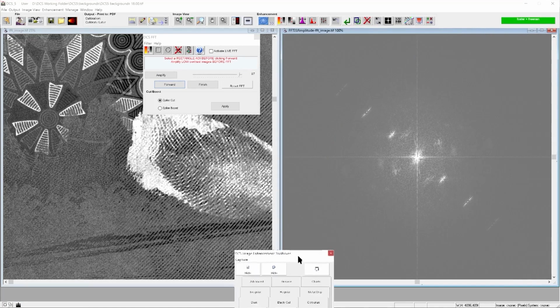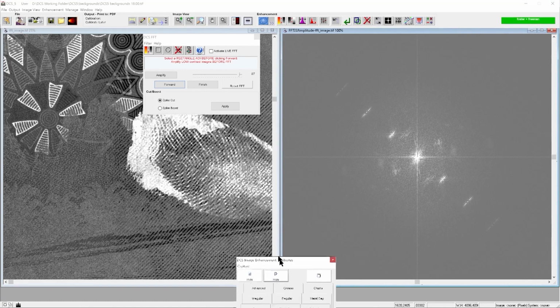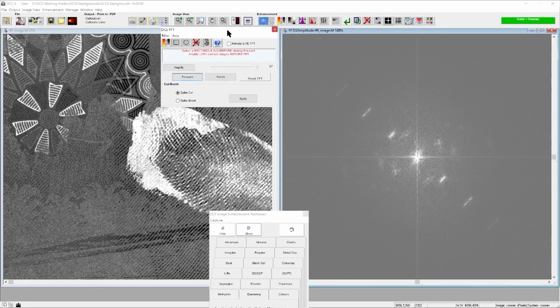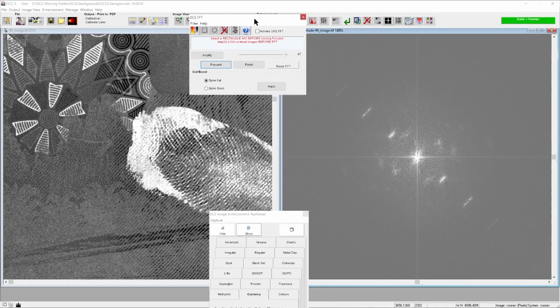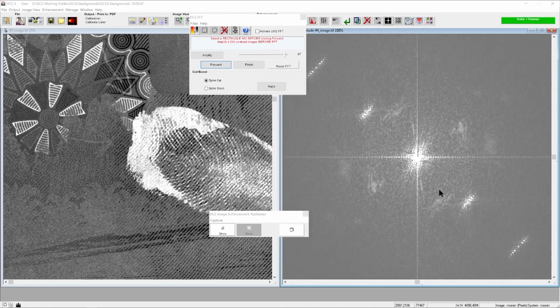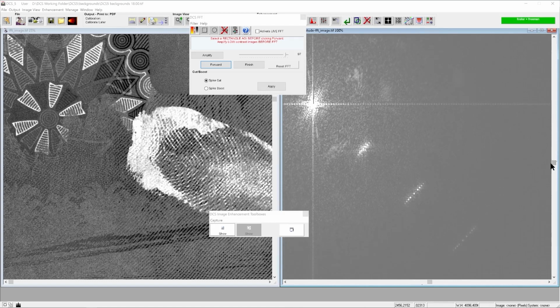And we're looking at our series of white spots. And we're going to, first of all, show you that the diagonal lines here relate to the spots you can see here in your image. So if we zoom in, we're just going to look at the bottom right-hand corner.